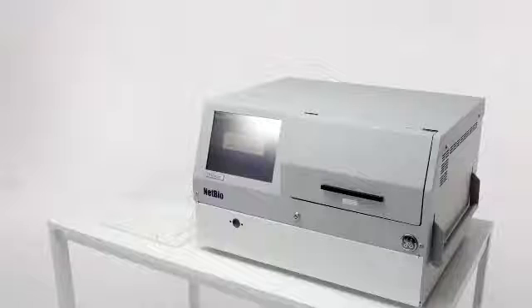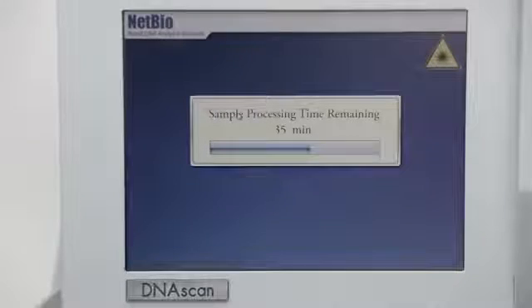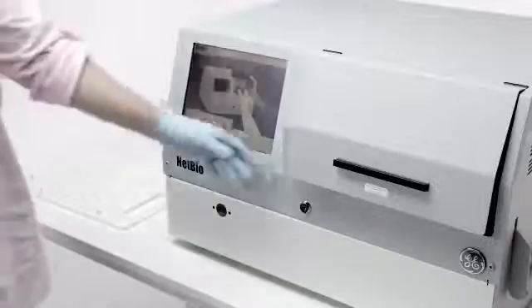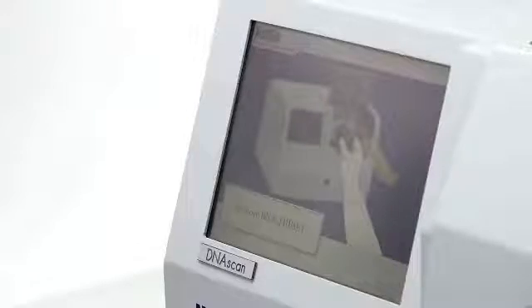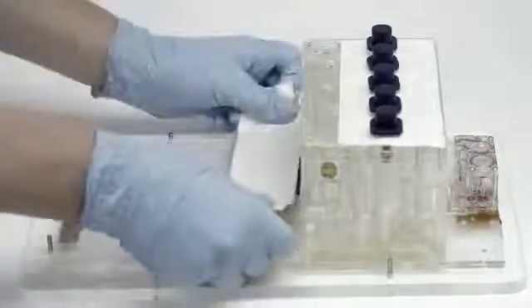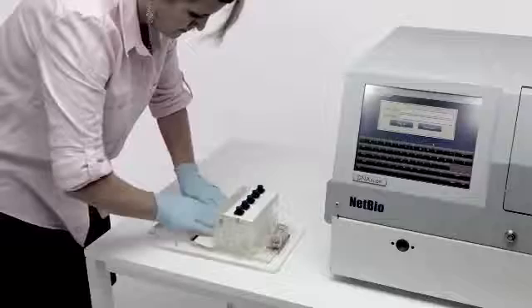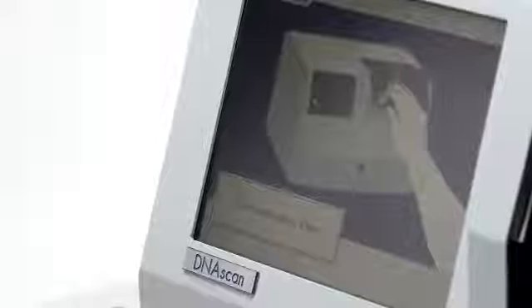Once the Biochip Set Cassette is loaded into the instrument, the sample run will begin. A progress bar will be displayed on screen to inform the user how much time remains until the run is complete. When the laser is active inside the instrument, the laser icon will appear on the screen. At the completion of the run, the access door will open automatically and the user instructions on the monitor will inform the user that the run is complete and instruct them to remove the Biochip Set. Wearing gloves, carefully remove the Biochip Set Cassette and cover the pneumatic interface with tape. Handle and dispose of the used cassette according to state, local, or regional regulations. Close the access door on the instrument to complete the run.